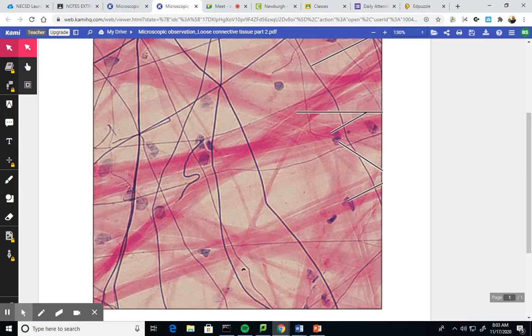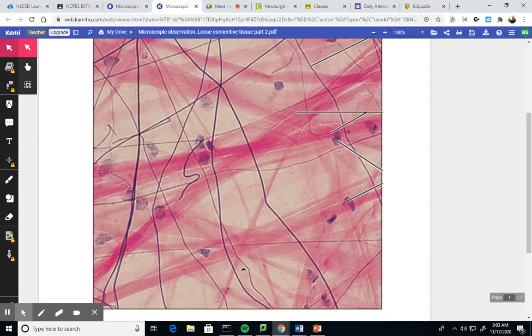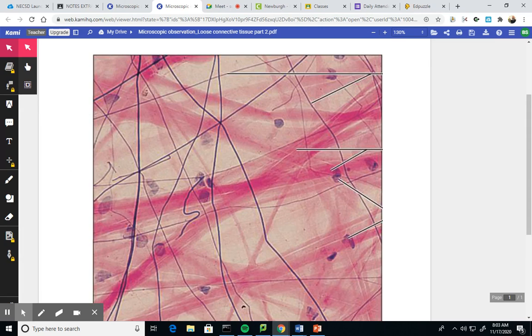What do we think? It doesn't look like these fibers and this matrix are put together so tightly, does it? Mr. Caff, what do you think? No, I think there's a lot of space in there. Yeah, that's the big clue. There's a lot of different material that we see in there, but it's not really packed together. It's loose. Oh, yeah, that's a big hint you just gave.